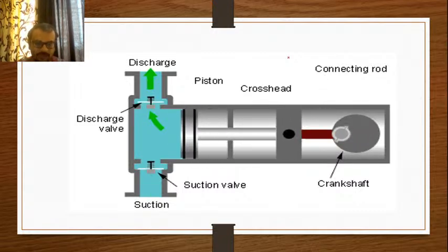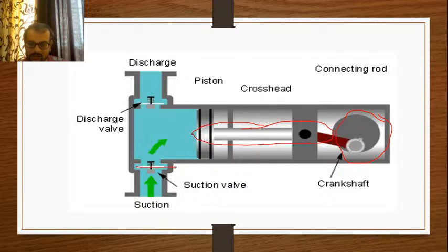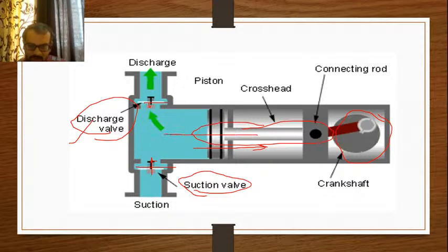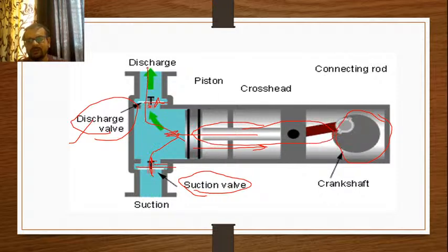So this is the motor driven piston. This is the piston, attached to the motor. These are two valves. This is the discharge valve or separation valve, and this is the suction valve or entrance valve. Now at the backstroke, remember, this valve remains open and this closes. As the piston moves forward, this valve opens and this valve closes, so that the solvent will flow in a uniform, unidirectional way. From here it will gain its access into the column.